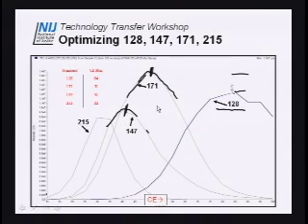So remember, 215 was maximized early on. When you go back and look at your slides, you'll see that it's about 30 volts or so. That's where 215 was maximized. So if I wanted to choose 128 to 215, I would set it at 30. If I wanted to choose 128, I would actually set it to about 84. So now I found the collision energy that best produces 128. Okay? That's what building an MRM method is all about.